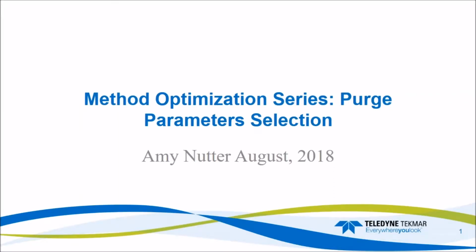Today's presentation is Method Optimization Series, Purge Parameter Selection. Amy Nutter is our presenter today. She is an applications chemist.